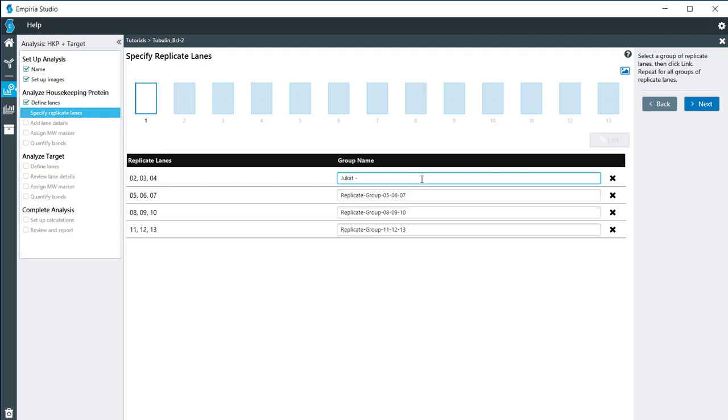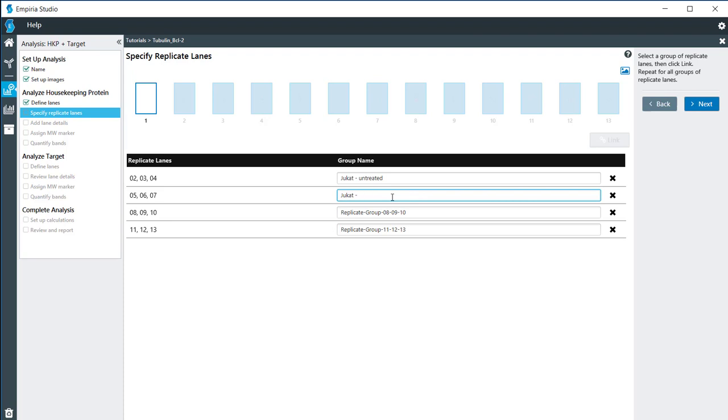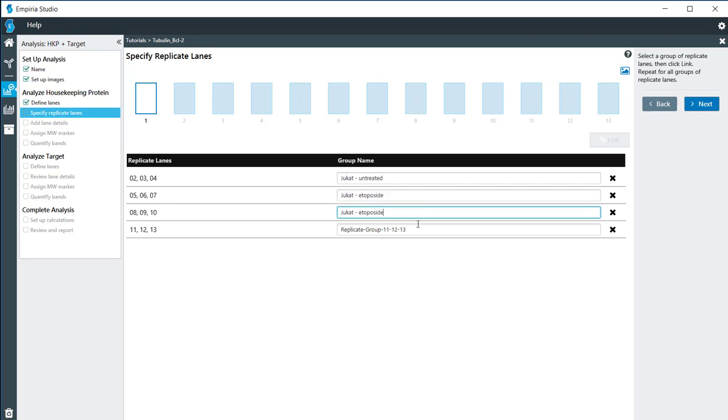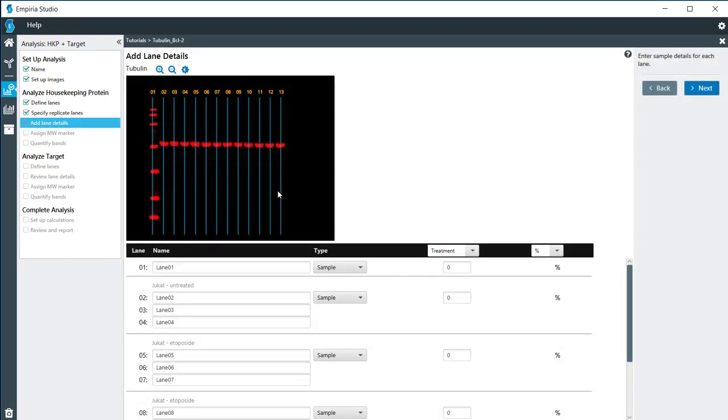My first replicates are the untreated controls, and these have been treated with etoposide. So I'm just going to copy that information into my other replicates. I'm going to click on start names and then click next.